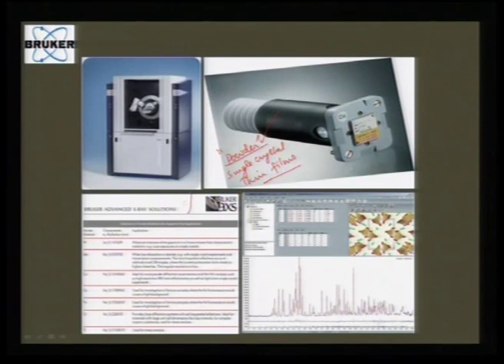And as you see in this cartoon here, you can have tungsten, molybdenum, copper, cobalt, iron, chromium, titanium, all these K alphas or L alpha listed here. But what I want to stress here is that iron K alpha is used for ferrous samples where the iron fluorescence would cause a very high background, or you can also use cobalt for ferrous compounds. So, if I am working with iron oxide or ferrite based samples, the fluorescence will be very high. Therefore, it is not advisable to use a copper K alpha in those conditions. For ferrous samples, you always use only cobalt or iron K alpha, which is highly recommended.